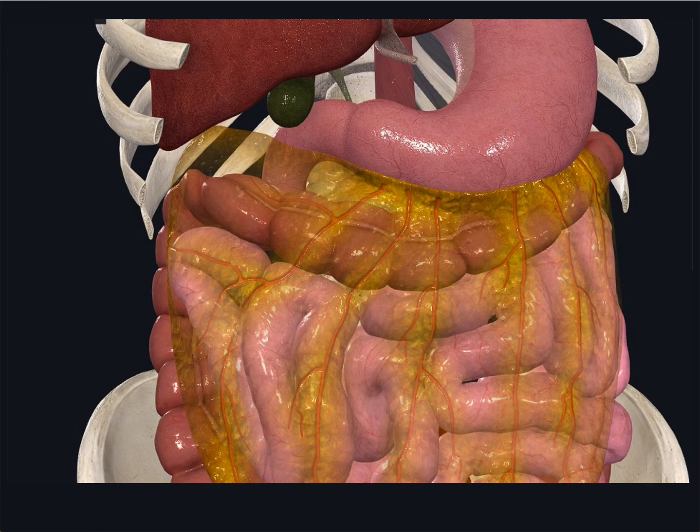There are many areas in the body where adipose tissue dominates, such as here in the greater omentum. Adipose tissue is very vascular. You can just see a small blood vessel running alongside the adipose tissue in this region here, as well as here, and also here.